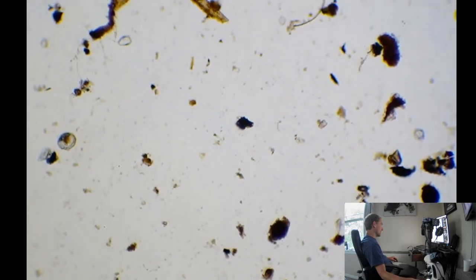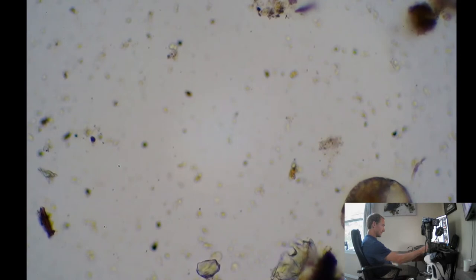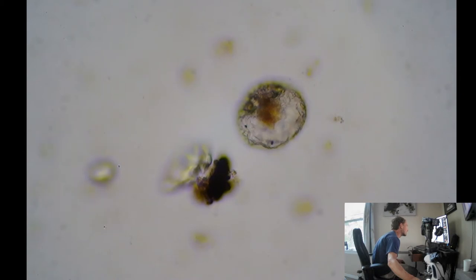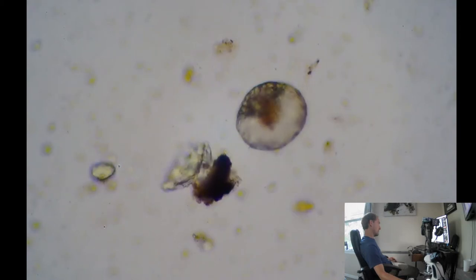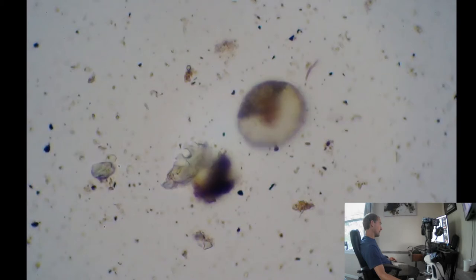Still a lot of nice aggregates. Oh, we got a very round thing over here. What's that? Is it moving? Alright, let's scope that out real quick. A little bit closer. Oh, wrong way. More light. Yeah, it's rare you see something perfectly round. What is that? It's a lot like that other thing that we were looking at too. Just a little rounder, but the same kind of texture. Little fungal hyphae right there above it.